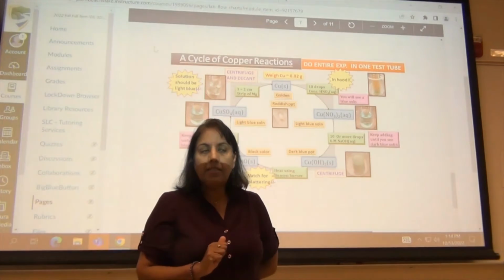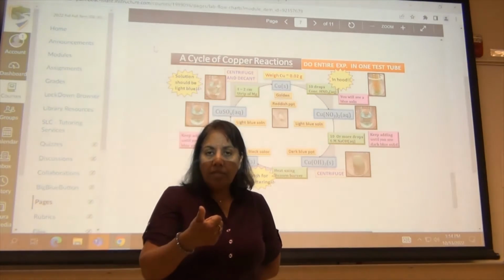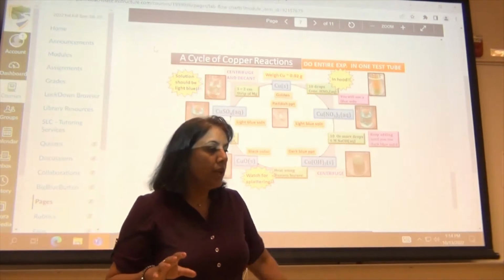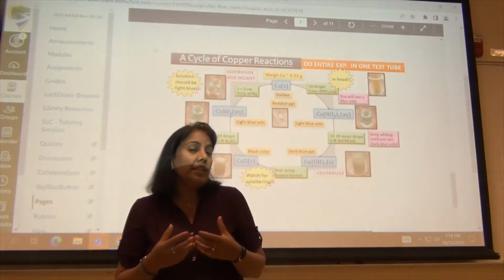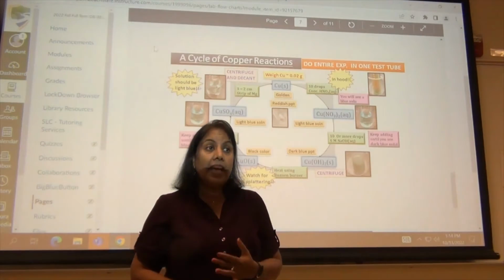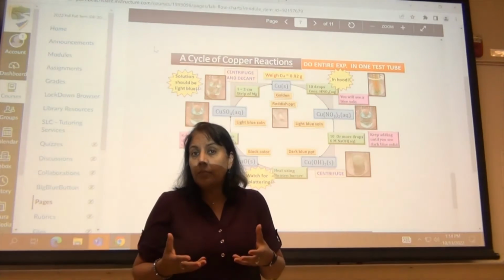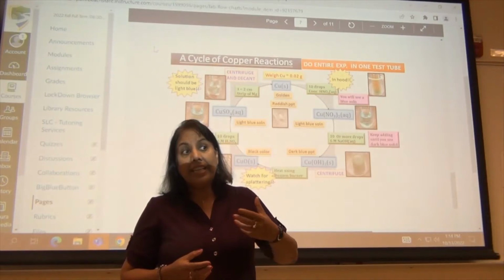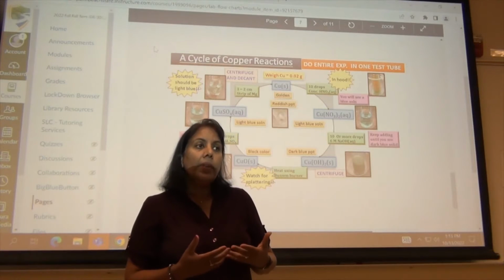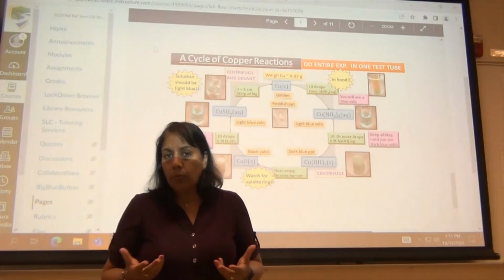If you see a precipitate, then you should write that a precipitate was observed. Not only that, what color was the precipitate? How thick was it? Don't write chunky, we'll leave that for soups. Just write whether it was thick or fine precipitate, if you can tell from the picture. If you see any gas formation, what was the color of the gas? How much was it? Was it very intense, or just light? If you see any bubbles or effervescence, as we call it: effervescence really is literally bubbles forming in a solution. But gas evolution without bubble formation is also called effervescence. So you can write either way as you wish.